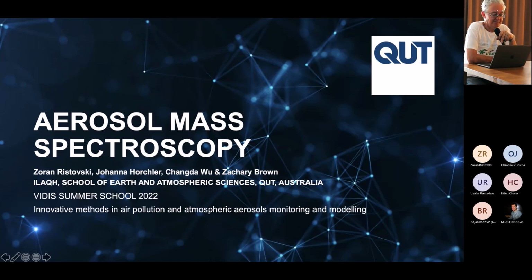The next part of my presentation will be on aerosol mass spectroscopy. So, just an example of two different methods to analyze and understand changes in PM and to analyze and understand the toxicity of PM.